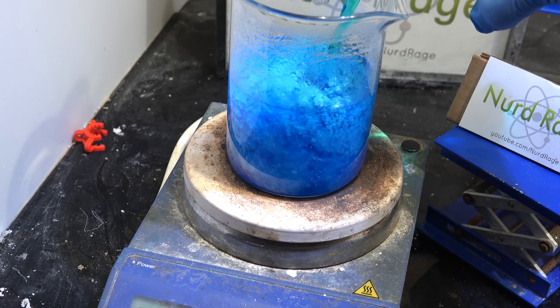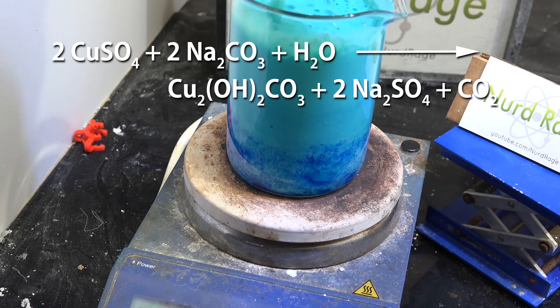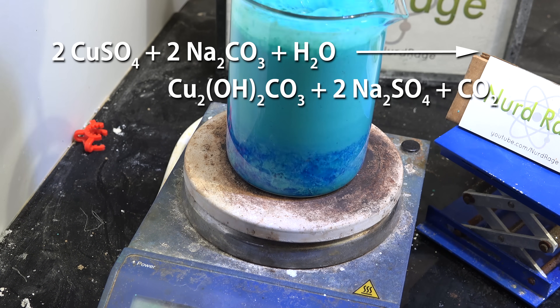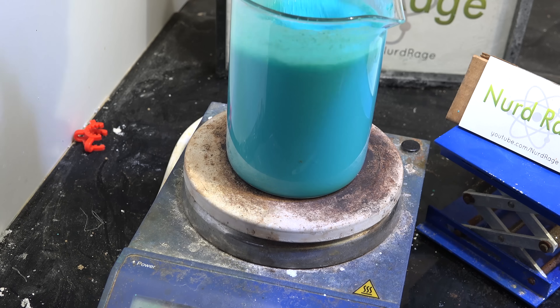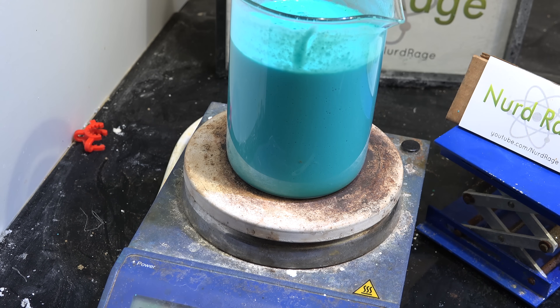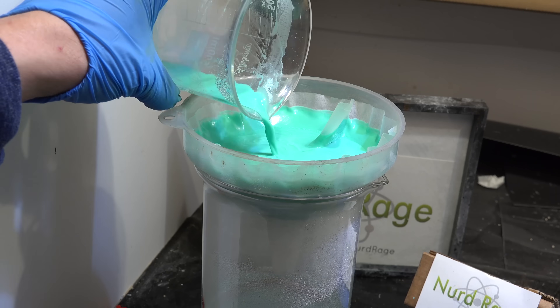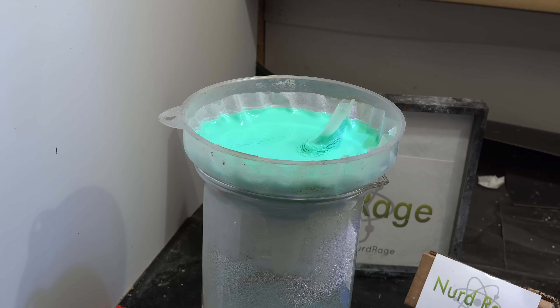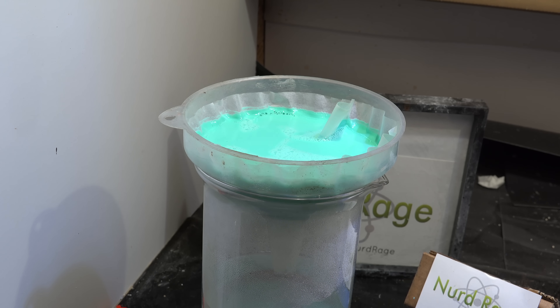Now we add both solutions together. What we're making is copper carbonate hydroxide, sodium sulfate, and carbon dioxide gas. It'll bubble a lot so it might help to stir it and keep it from overflowing. It's pretty thick at first but as it reacts it thins out somewhat. When the bubbling stops the reaction is finished and we can now filter out our copper carbonate hydroxide. Wash out the containers with water for a quantitative transfer, and also wash the precipitate with generous amounts of water to wash out the byproducts and impurities.